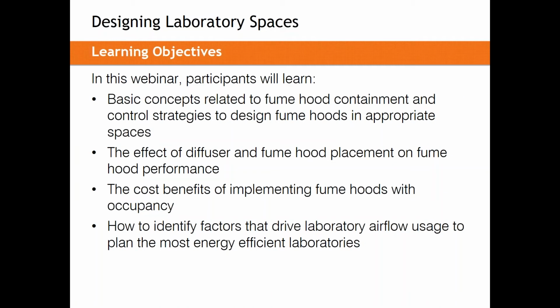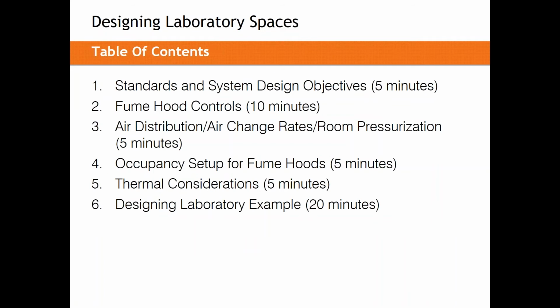We're going to work on the basic concepts related to fume hood containment and control strategies to design fume hoods in appropriate spaces. You'll learn about the effects of diffuser and fume hood placement on fume hood performance. We'll cover the cost benefits of implementing fume hoods with occupancy, and we'll identify factors that drive laboratory airflow usage to plan the most energy efficient labs.